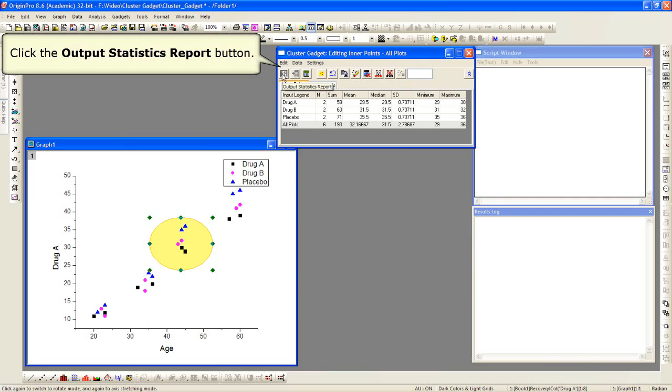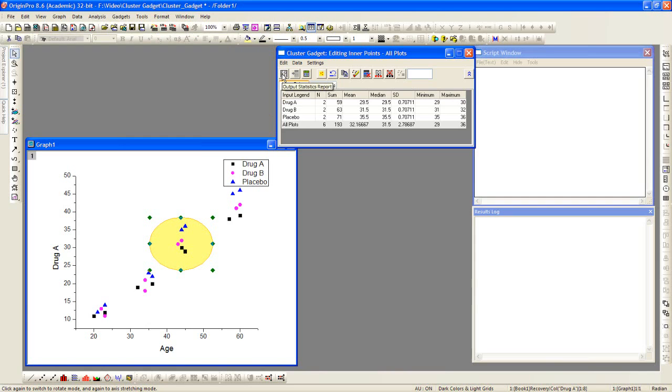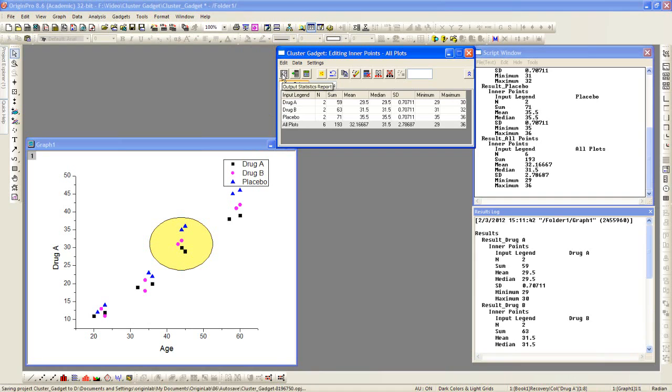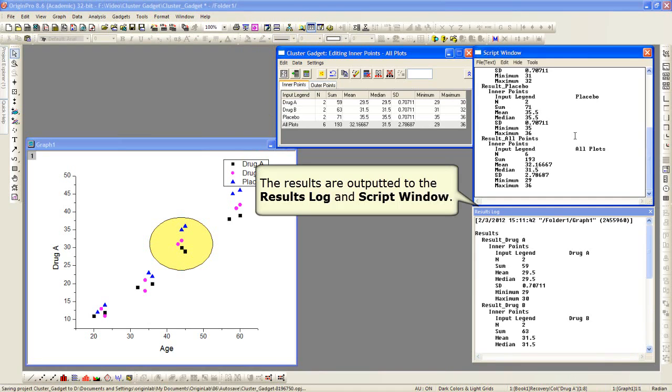We can click the output statistics report button, which will then send the results, instead of just displaying in the dialog itself. It'll output these and show them in the script window, the results log.